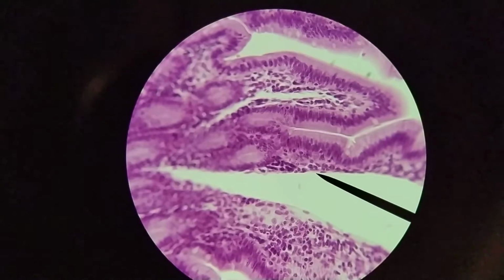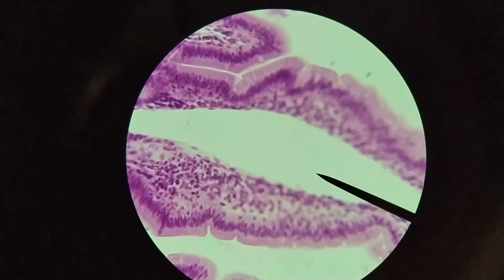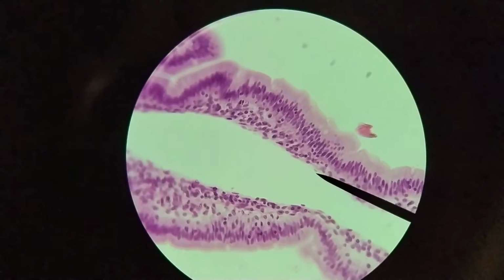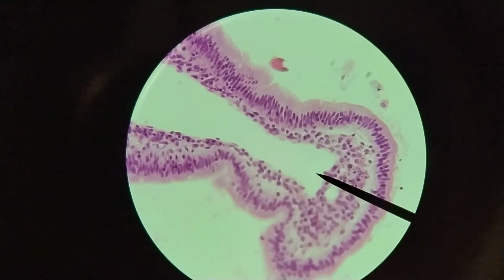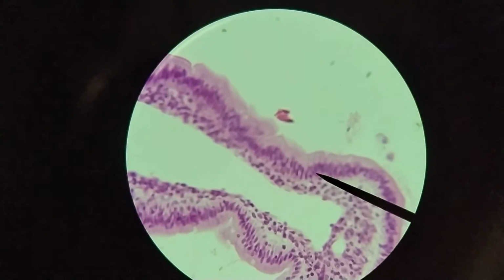Okay, so this is not just an artifact of preparation. There's not a gap or anything. It's actually a vessel, a vascular system. So this is a lymphatic vessel. It's a lacteal. So again, things that are relatively small can pass across into the bloodstream fairly easily.